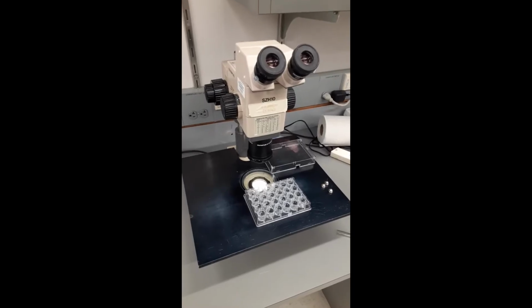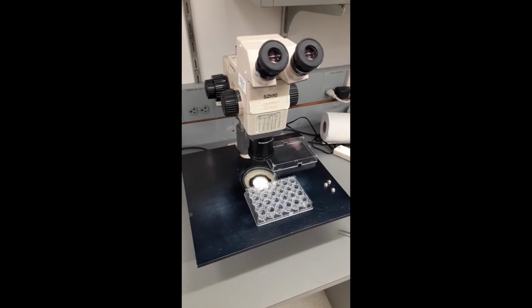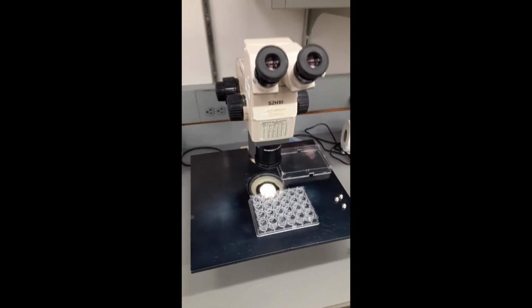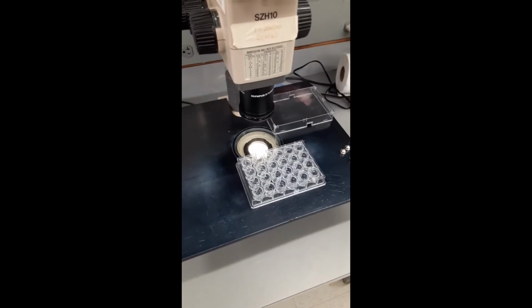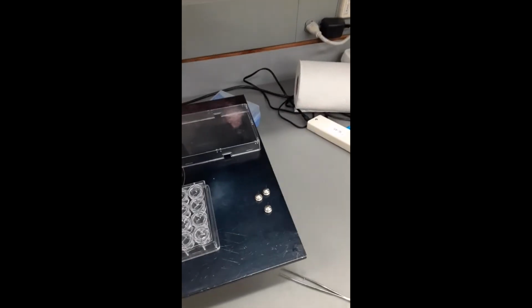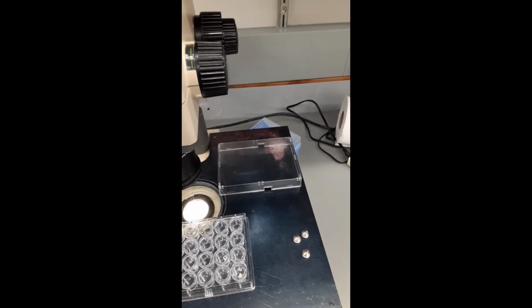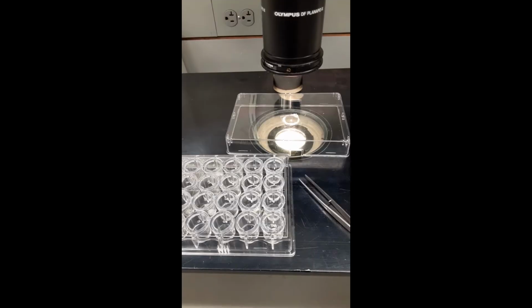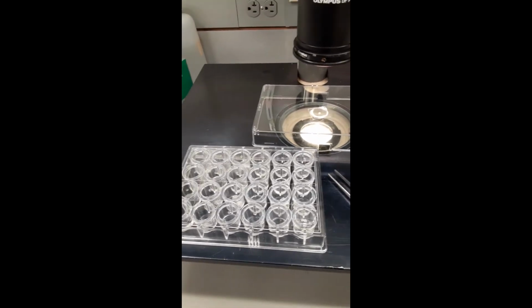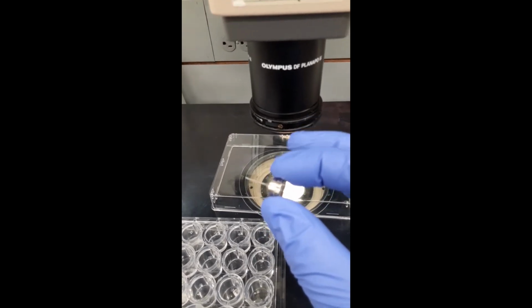So now we'll take one of the grown crystals from an experimental plate and load it onto the X-ray machine. So here we have our microscope that will be able to look at the sample, our crystal plate here, some assorted sample loops of different sizes, as well as a working stage. I usually use the lid of the tray to work on. So I've taken one of the cover slips off the plate, put it on the microscope, and I'm going to use one of our sample loops to pick up the crystal.